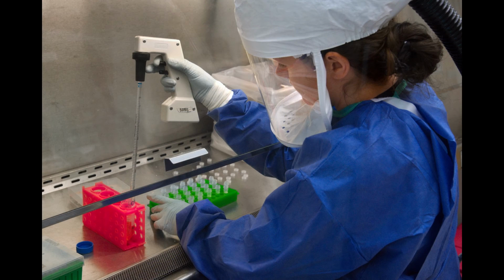Going to the next level is Biosafety Level 3, Physical Containment Level 3, or Biosecurity Level 3. This has all of the requirements of Levels 1 and 2. This laboratory level is where things start to get interesting. And by interesting, we mean that it's pathogens or other things that could be considered dangerous despite being indigenous or part of the normally occurring flora and fauna of your body.